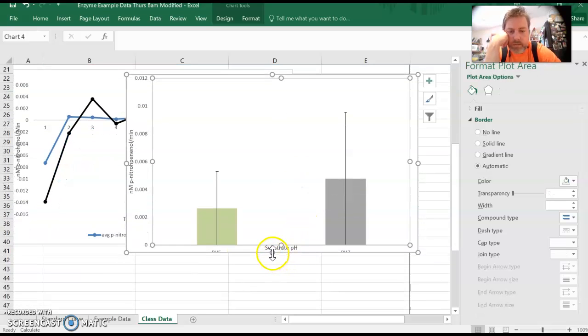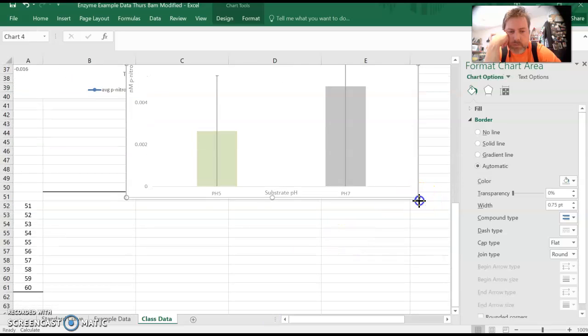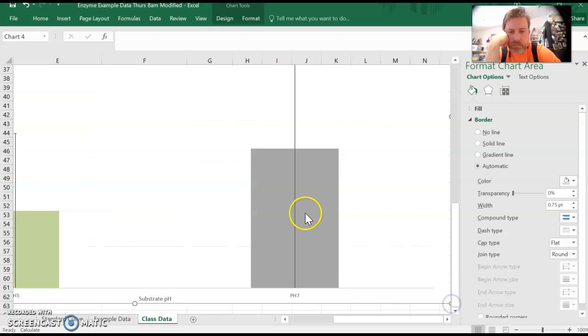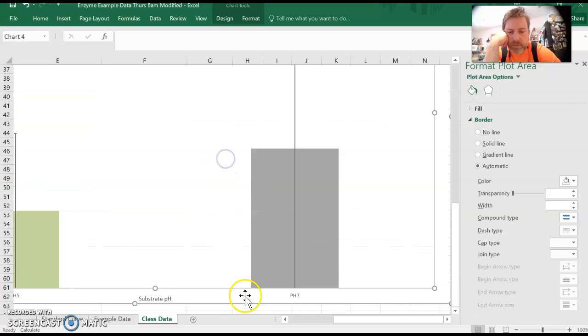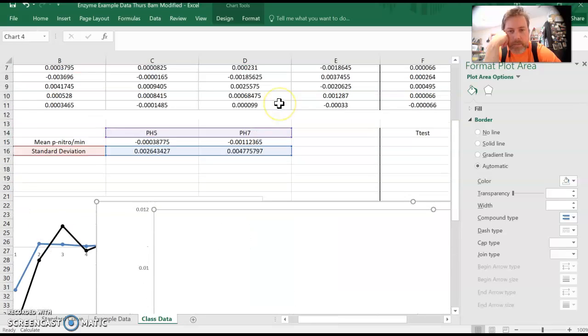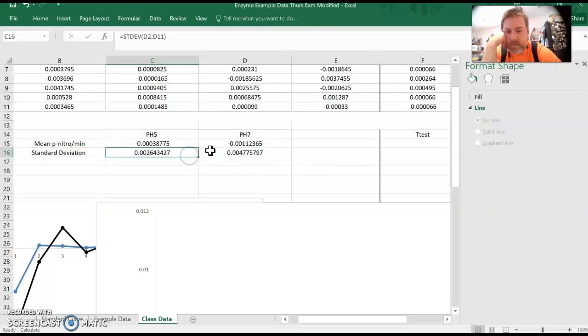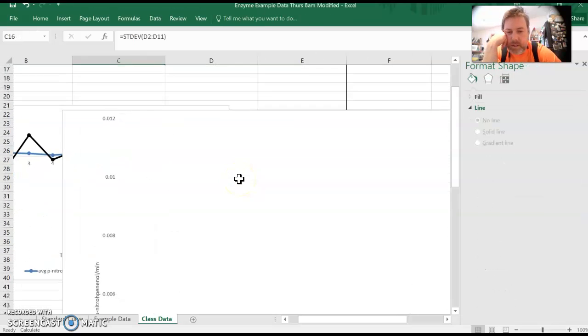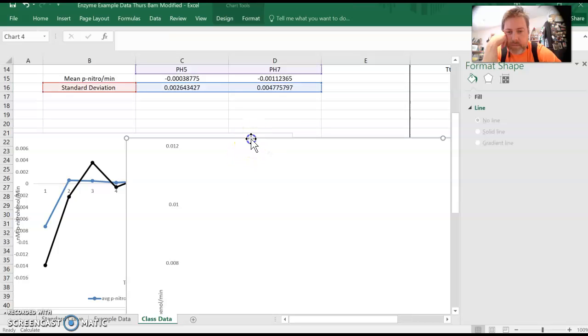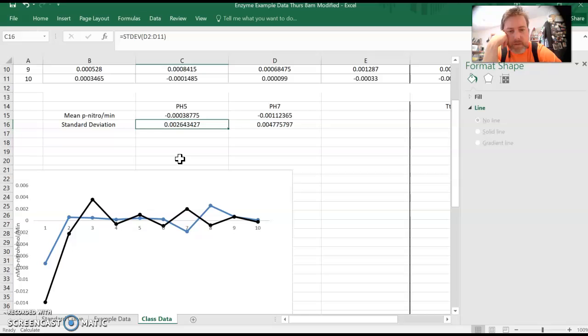What happened there? Why does that look like that? That's not right. Okay, that's just a weird zooming thing. I don't know what's going on there. So I'm going to ignore it. Anyway, I think because I'm selected up here, it did weird things to it. All right, stuff like that happens. Generally, delete it, start over. That'd be found to be the best way to do things.